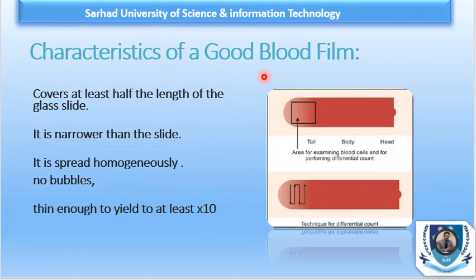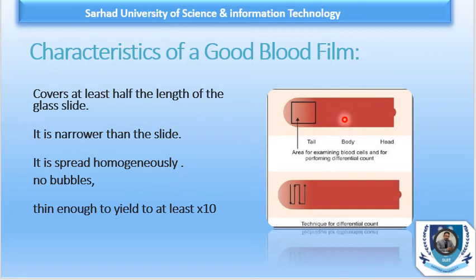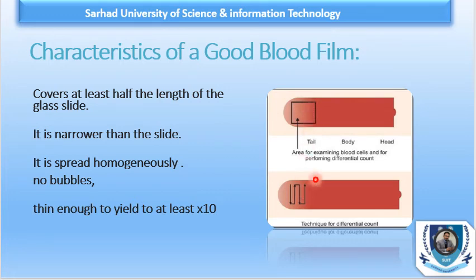The characteristics of a good blood film are: it should cover at least half the length of the glass slide, be narrower than the slide, spread homogeneously, and should not have any bubbles, streaks, troughs, or holes. It should be identifiable into head, body, and tail. The head is near the drop where there are a lot of cells and is not the best area. The body is the middle area, and the tail is the thin terminal part — the best or ideal place for morphology is near the tail.